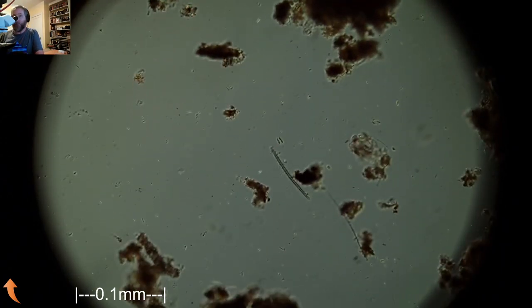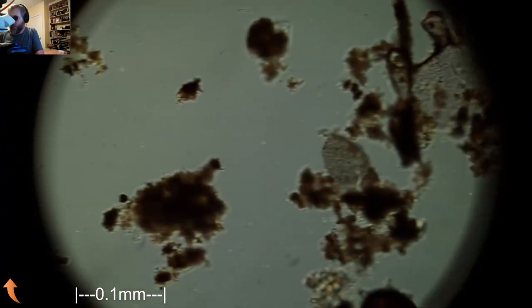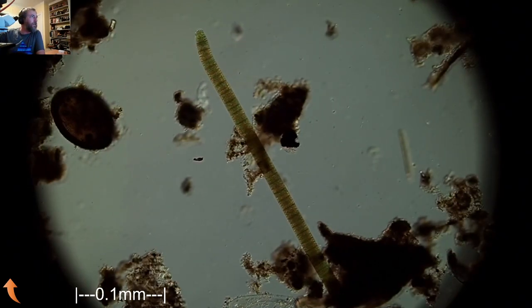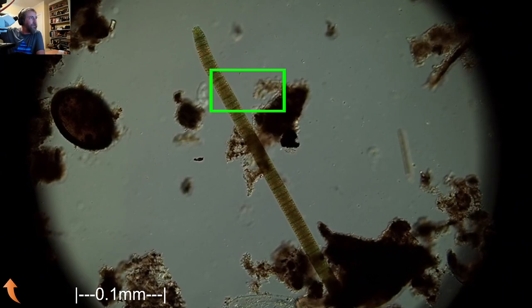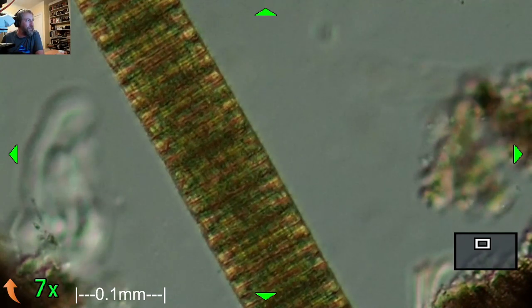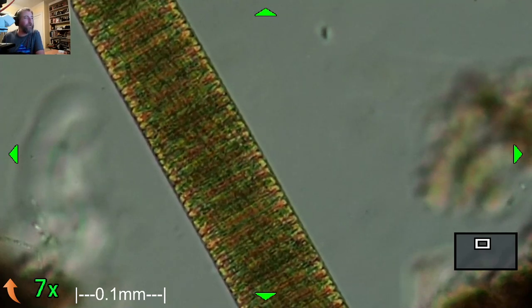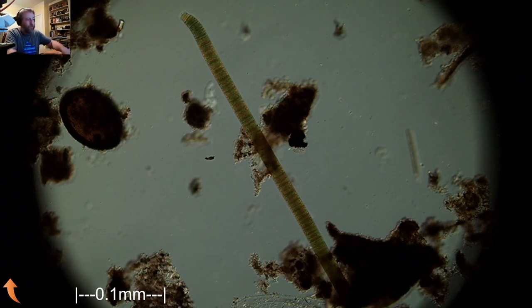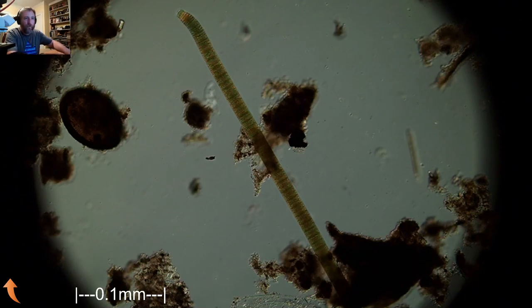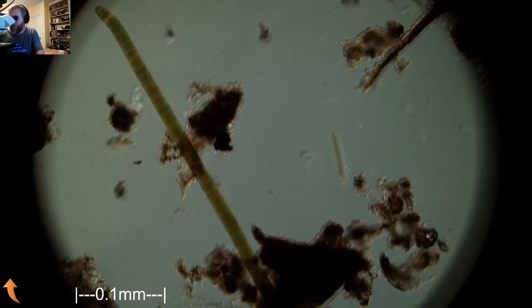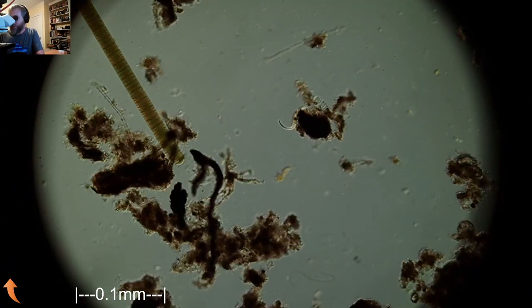Right there. Diatom. And that's a sponge spicule right there in the middle. It's a little piece of a sponge. That is Oscillatoria. This big thing here. You can see it's actually moving a little bit. That's not just the slide drifting. That's actually Oscillatoria. They can actually kind of move around a bit, even though it's a cyanobacteria. I've ever met one that wasn't cool. I don't know, Sweepy. Also, sorry, I didn't give you a shout out. I should give you one. Pacific Plankton was here earlier. She usually does all my shouting outs. Not that I'm lazy, but I've got two hands running the microscope, and usually my eyes running the microscope as well. That's another Dileptus. That's the same thing we were just seeing. This third one.